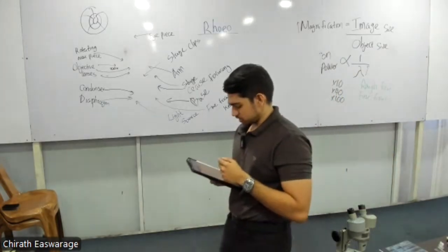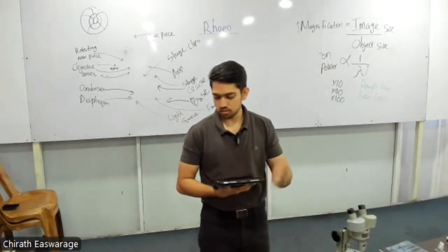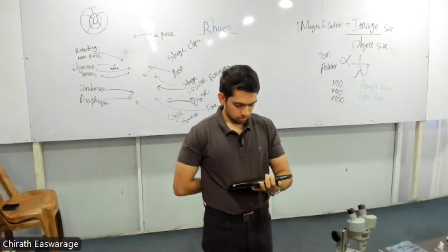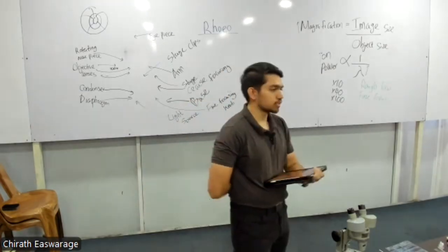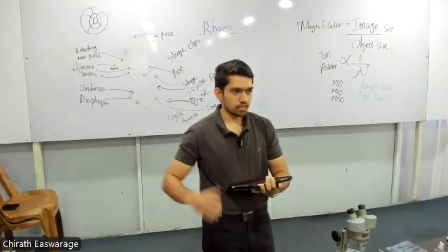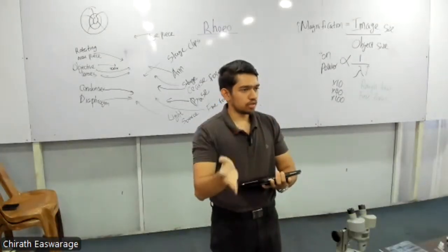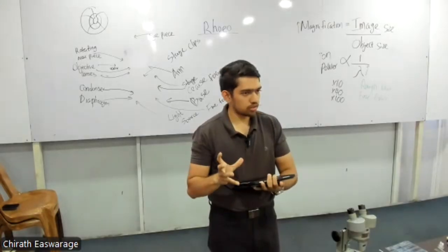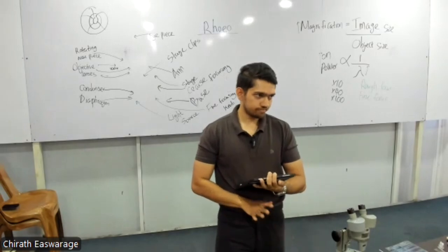Here the specimen scatters many electrons, whereas others are absorbed. This instrument is ideal to observe the surface view in 3D appearance. We can nicely get a 3D view of the surface. What is the outer plasma membrane like, and what are the structures attached to it? Things like that we can observe using the scanning electron microscope.